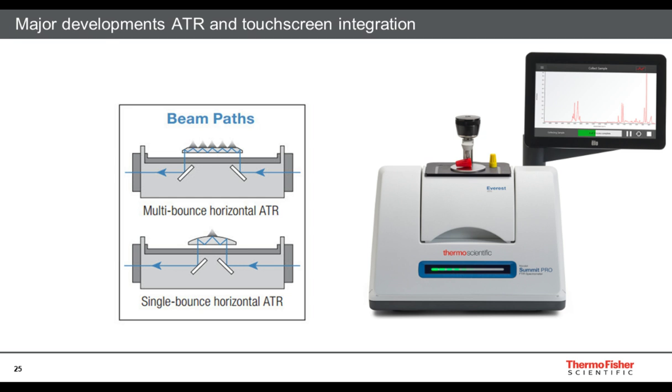How this works is a beam of light is injected into the crystal at a particular angle, at which point it will undergo a process called total internal reflectance. At the point of total internal reflectance, 100% of the input light is reflected out. There's no loss of the light intensity due to reflectance, and so you get 100% transmission out the other side of the crystal.